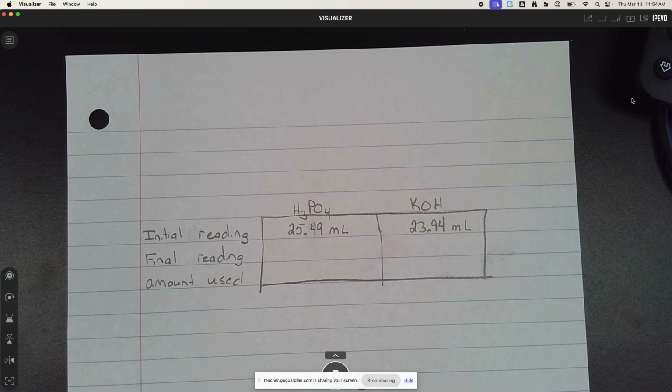I'm going to start by putting some phosphoric acid in my flask. And I'm going to take quite a bit, a little over 10 milliliters, so that I've got 4 significant figures on my volume. The other advantage to taking quite a bit of this is that if you end up off by a little tiny bit in the very end, a little tiny bit of 10 milliliters is a much smaller percent error than a little tiny bit of, say, 1 milliliter. So I've got some phosphoric acid in my flask.